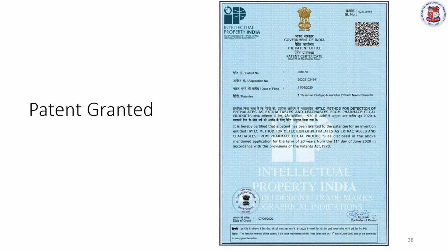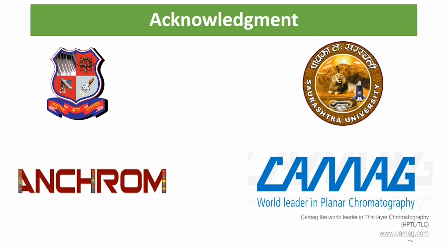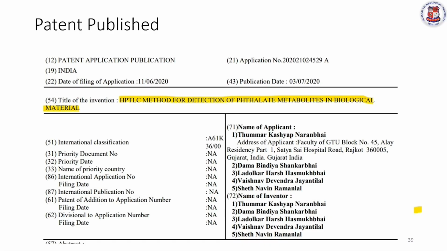So as the first part, we applied for a patent with the Indian government for the HPTLC method for the detection of phthalates, extractables and leachables from pharmaceutical products, and we got the patent for this study. And for the other part, the HPTLC method for detection of phthalate metabolites in biological material, it is already published, but still under evaluation. So we are hopeful that these methods will be granted a patent.